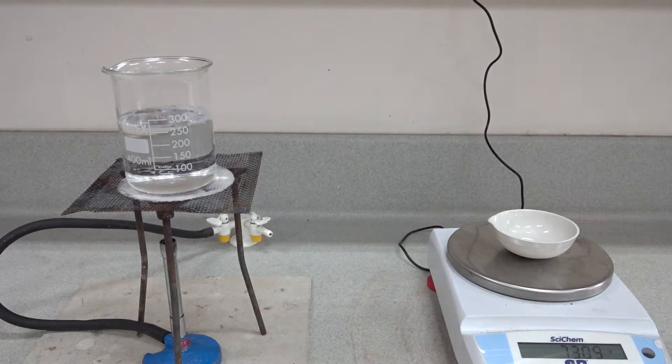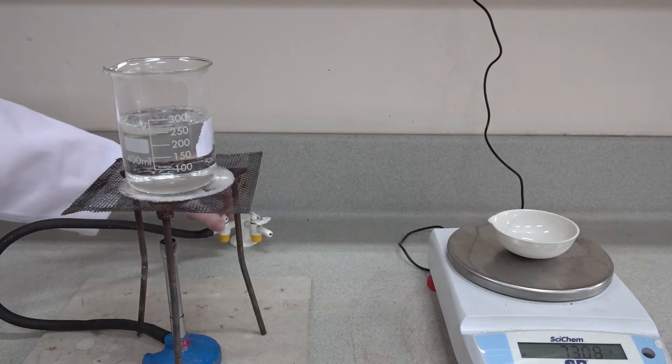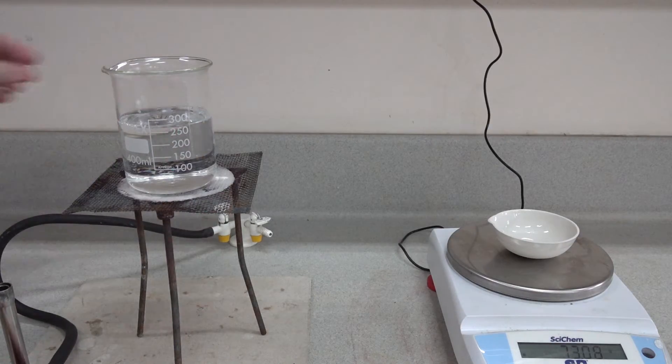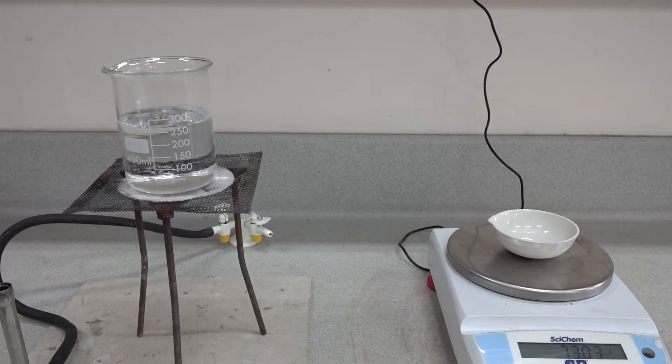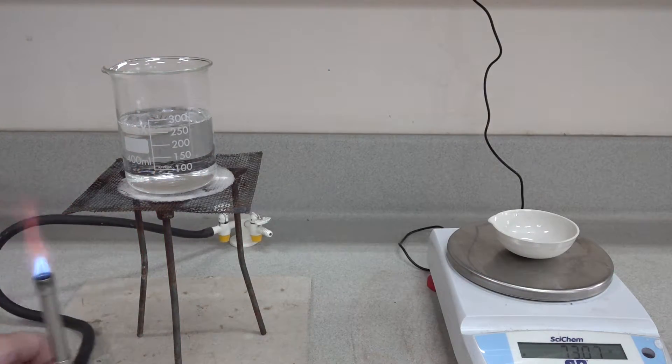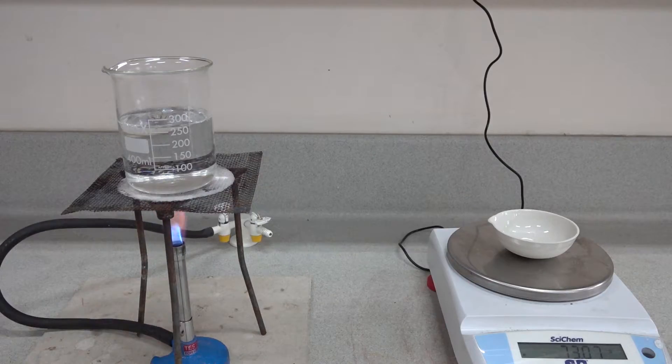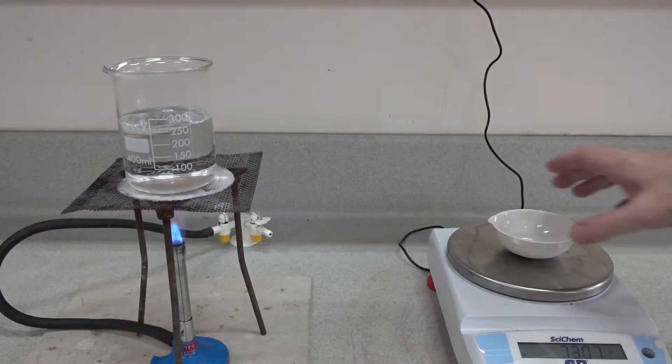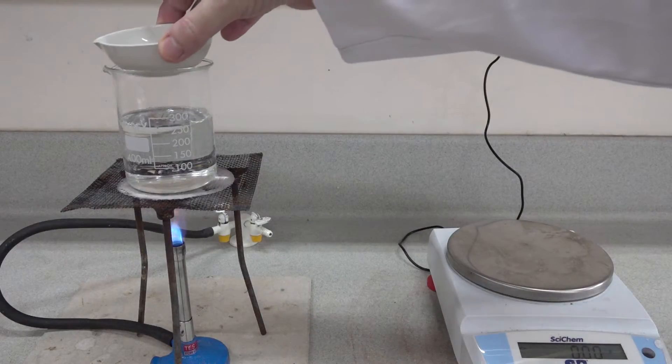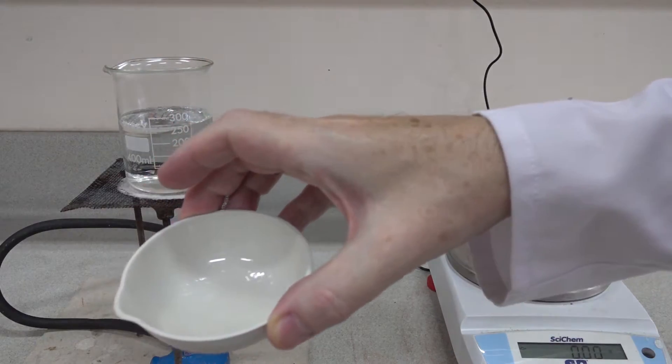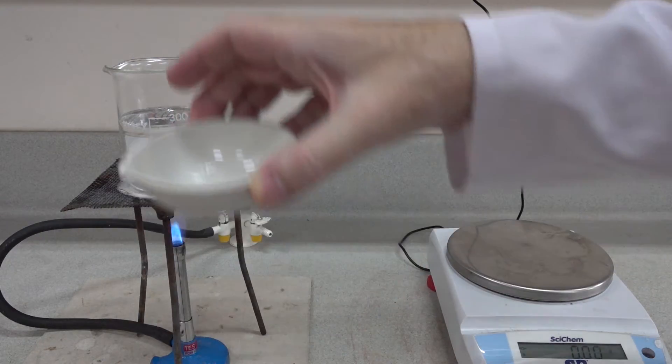We've already got some anti-bumping granules in the beaker, so let's turn the burner on and place our solution, which is already beginning to crystallize as it's cooled down, onto the beaker.